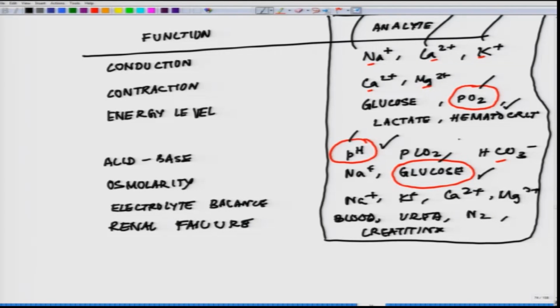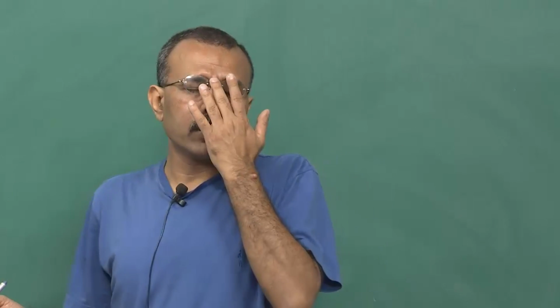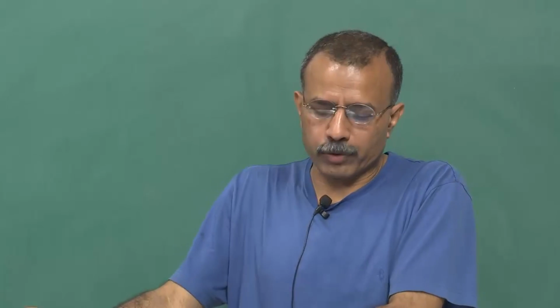So, today we will start off with the pH sensor, which is an ion selective system, and it is very interesting if you look at it historically. In the last class we talked about the metal electrode, and today the ion selective electrode. What I am going to highlight is the basic concept. I am not going to go into the in-depth detail, but the basic concept, which I believe will help you. So, what really is pH measurement using an electrode all about?